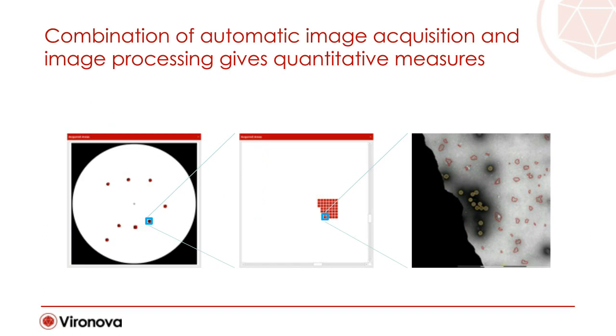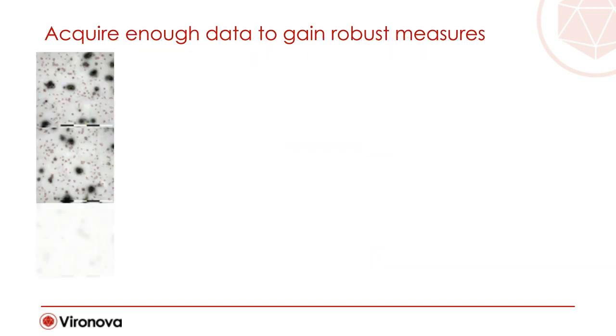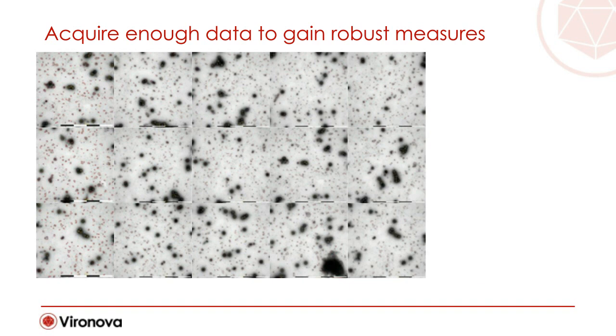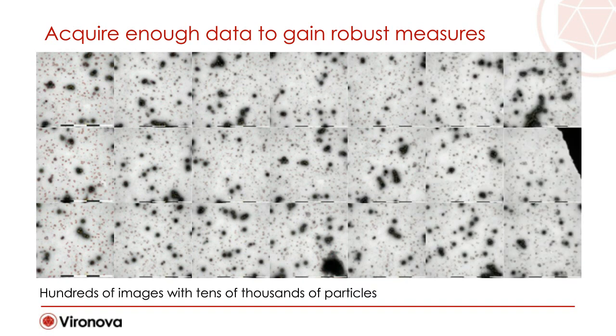So the system moves from area to area and collects images at each area based on user configuration. Each image is processed and particulate matter such as the primary analyte, but also undefined structures of interest, are registered and accounted for. This is done for hundreds of images with tens of thousands of particles available for statistical analysis. For biological samples, with their diversity and complexity, the automated operation takes about an hour. Easier samples take, of course, shorter time to process until convergence of statistical parameter estimations.